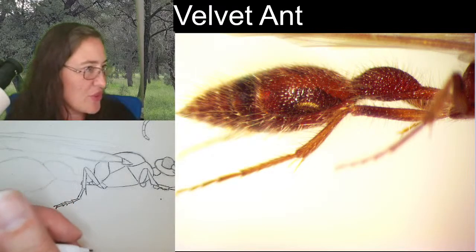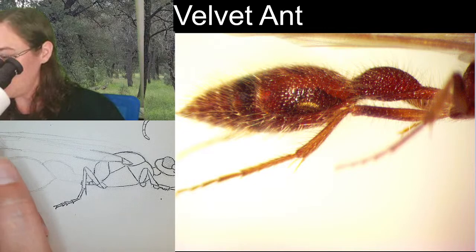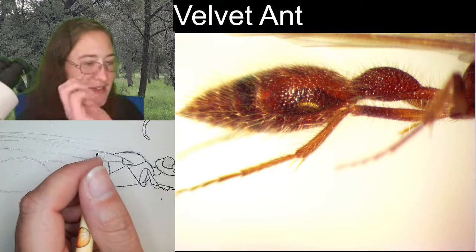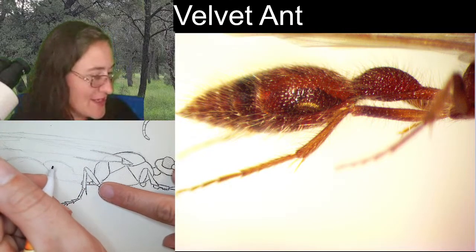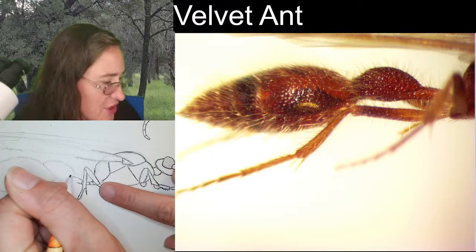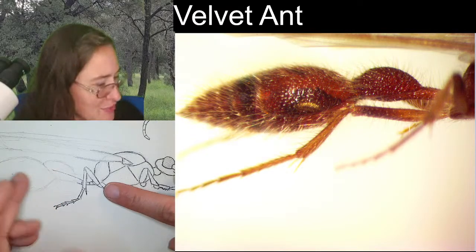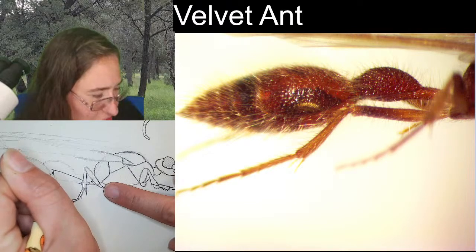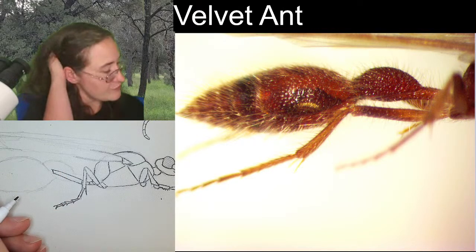So the femur looks like it's a little bit wider at the base than it is at the end. So we're gonna go just a little bit, and then we're gonna narrow a little bit. And it looks like the femur is going to be as long as approximately until the end of this first node here. I'm gonna use the word node, even though that's an ant term. Sorry. Okay. So that's the femur.